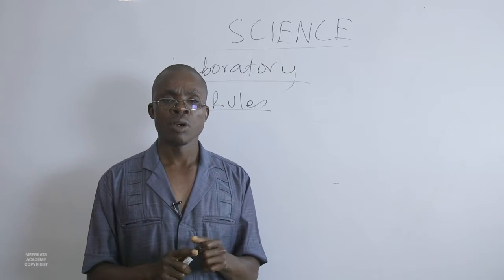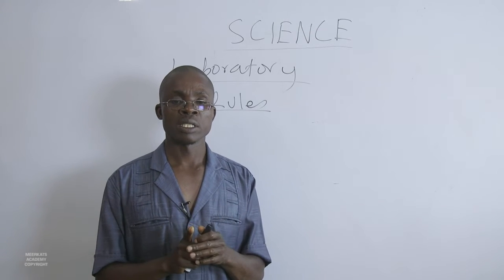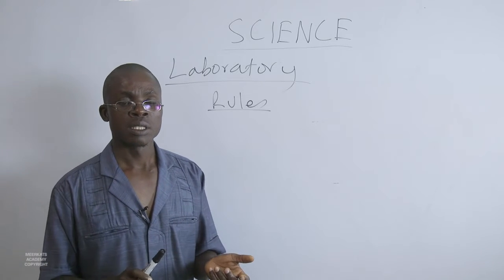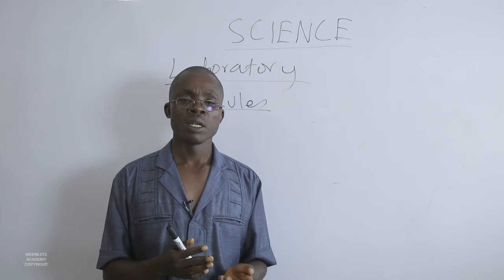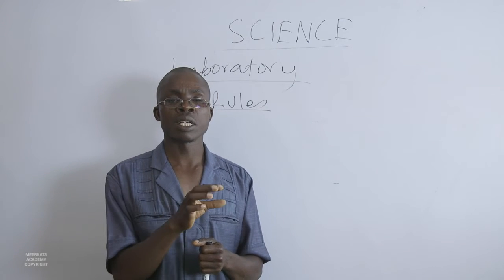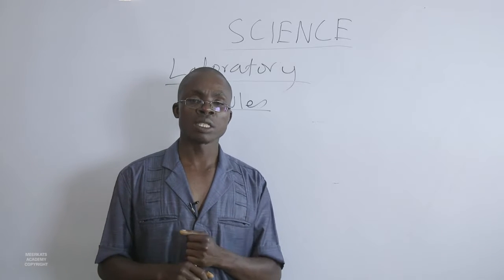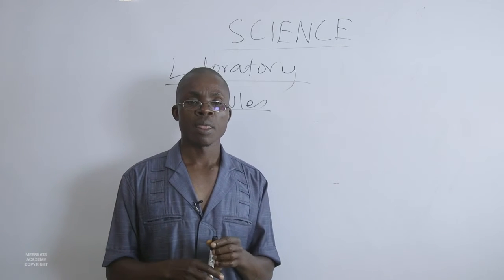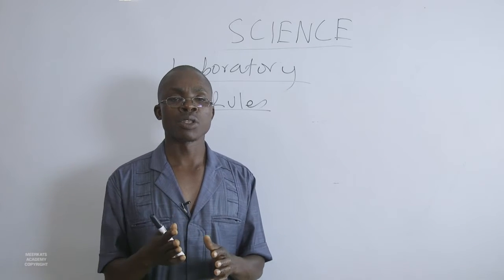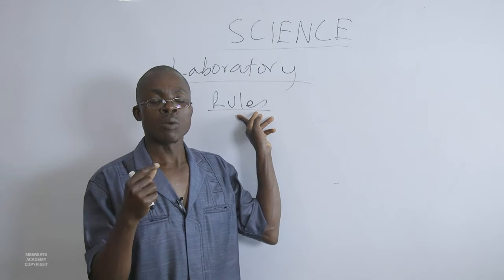Most of those ones. Flammable substances, or a sign to show hazard, dangerous substance. If you don't understand those signs, you may go somewhere in a lab where it hasn't been written in words. It is only written by virtue of that sign. So without your knowledge, you go use that substance in a wrong way. You may just end up hurting yourself, just because of one simple thing, you don't know the rules pertaining to those signs and what they mean.